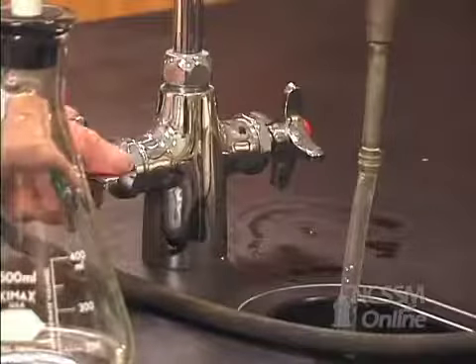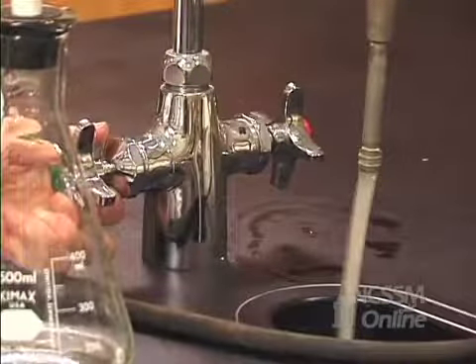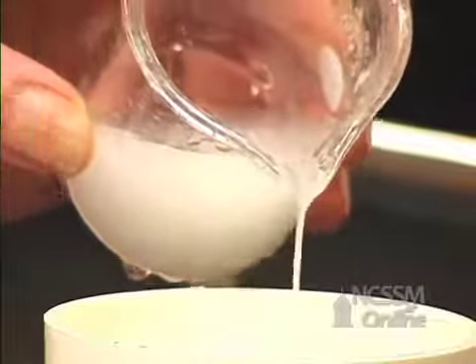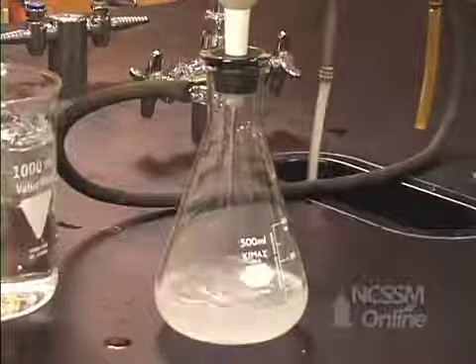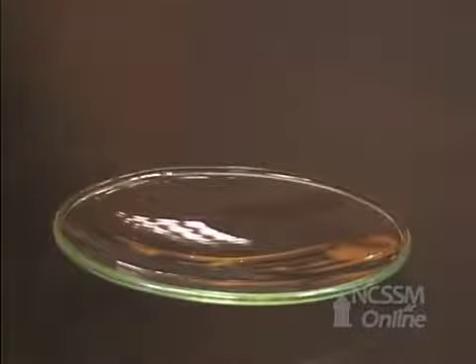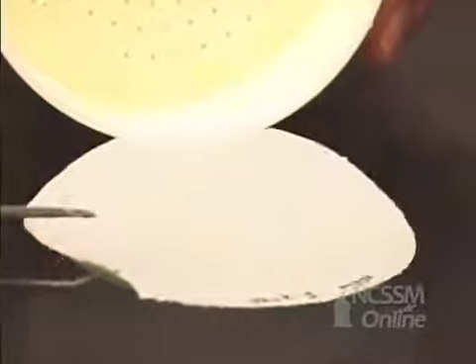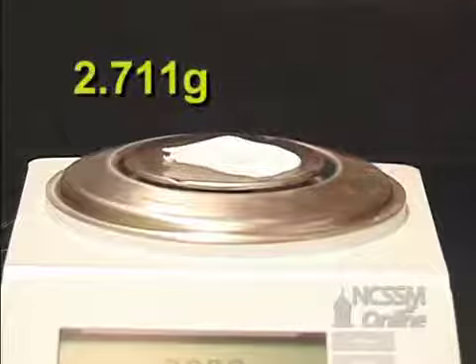Now we can turn on our aspirator and filter. Next we want to take out our filter paper with the aspirin on it and set it on a watch glass. Now we have to set it aside and let it air dry. Now we want to weigh our dried filter paper and aspirin sample. This is what one of the crystals up close looks like.